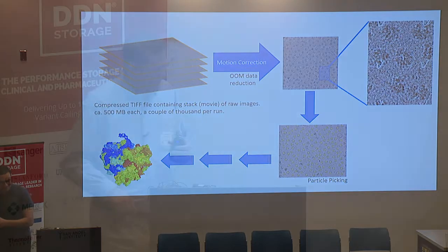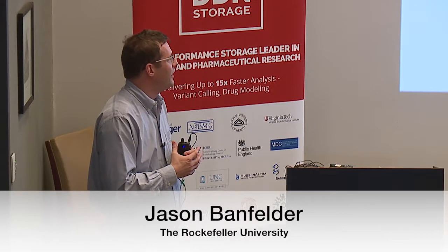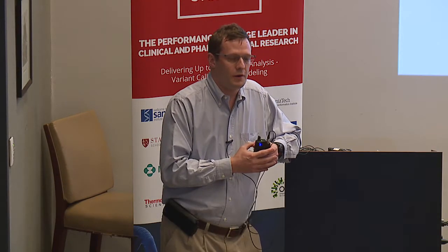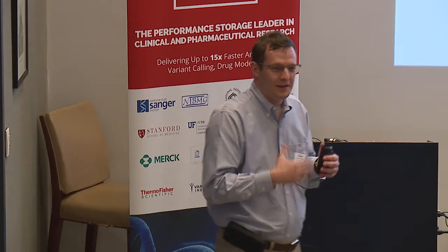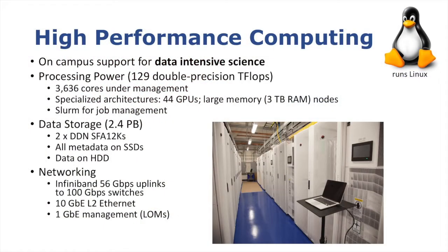Okay, great, thanks. I think Mark gave a good overview of the initial steps of what happens and what the end goal is. One of the things I wanted to convey here is that there are really good opportunities for data management. We asked who has a data management plan, and it seemed like things were very ad hoc. There are really great opportunities for data management when a core facility or a resource center, or whatever you want to call it in your institution, that operates these high data rate instruments gets together with the IT group and makes a solution. And that's one of the things that I think we've been able to do here in the CryoEM space.